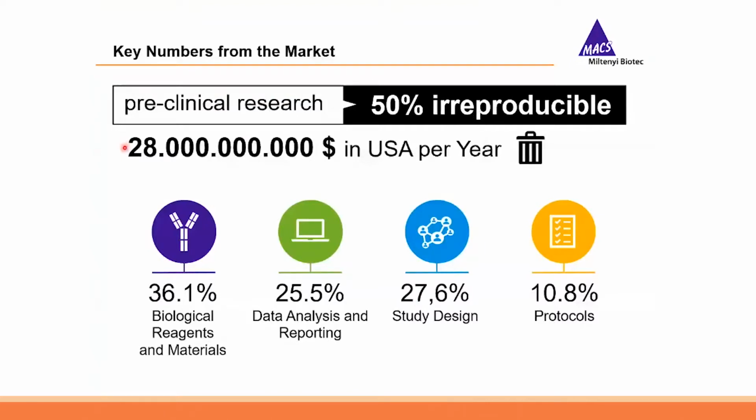But we still have the challenges of reagent reproducibility, ensuring data analysis and reporting consistently, that the experimental design for the QC is as robust as it could possibly be. And then in the case of multi-instruments or multi-site manufacturing, that the protocols that are delivered from site to site are reproducible by each site, and that they also give you consistency.